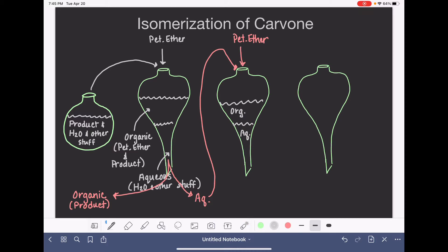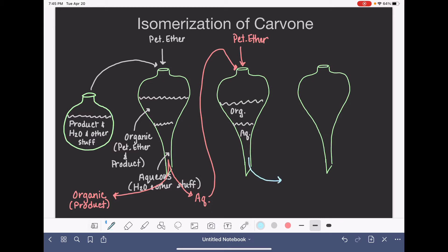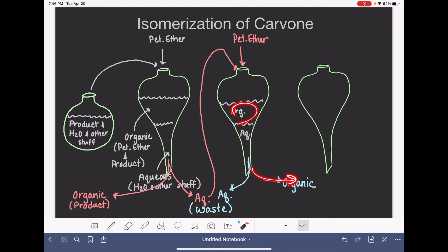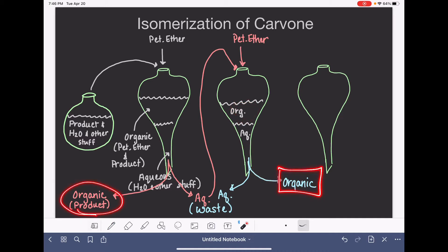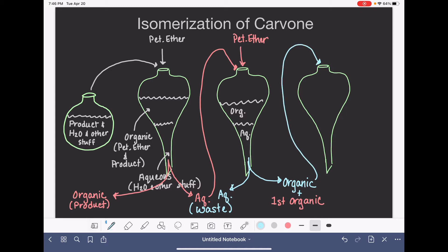When we drain this out, we'll drain the aqueous layer first since it's on the bottom, and that aqueous layer is waste. Then we'll drain the organic layer and combine it with the first organic layer. We're going to take both of those combined organic layers and put them back into the separatory funnel again for another round — this time adding sodium bicarbonate solution, NaHCO₃, which is dissolved in water. So once again we'll get an aqueous layer on the bottom and the organic layer on top.